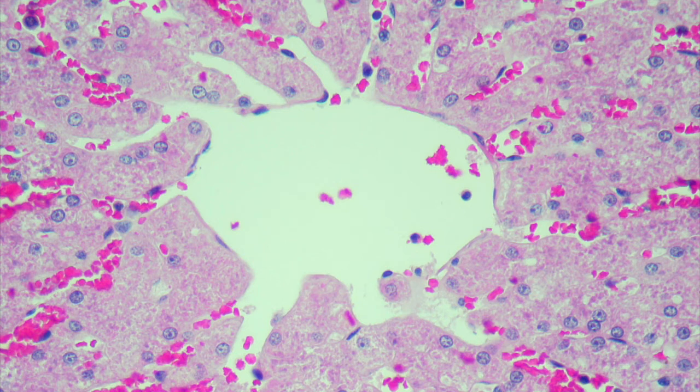Okay, so let's look at some outcomes. So here is a section of liver showing a central vein there, and we can see that things look pretty good, nice and clear under the 40x lens.